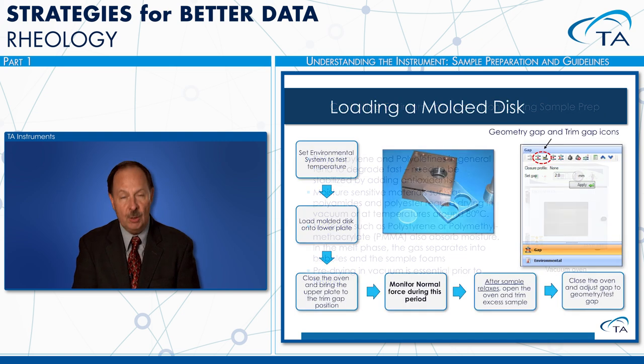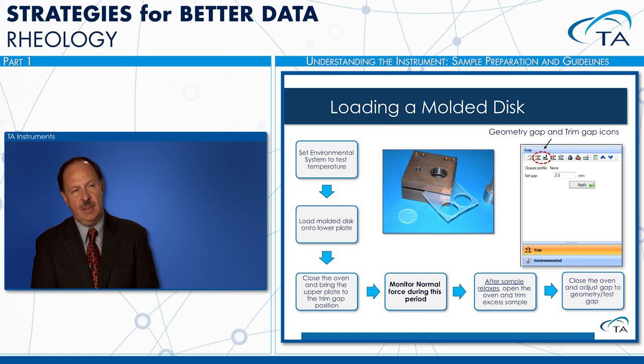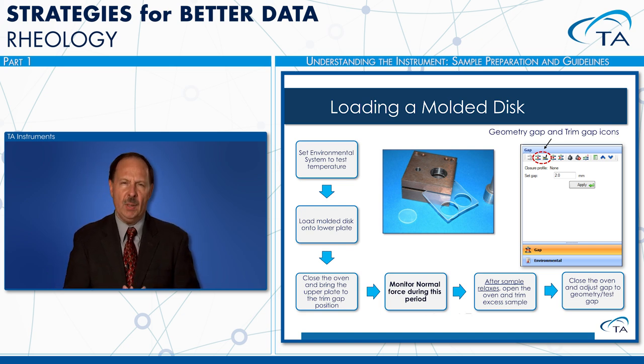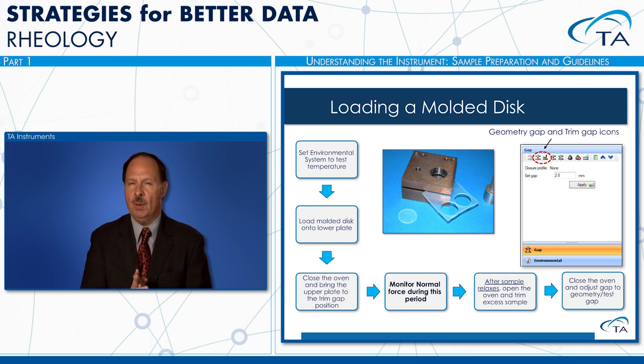So here we talk about drying some of these materials that are moisture sensitive. Okay, so loading a disc is somewhat easy. One thing I would add is it's a good idea to wear gloves while you're doing this testing, because you are working at high temperatures. Your plate's going to be 150, 190, 230, maybe 300. So that's a very hot temperature. So you don't want to hurt yourself.